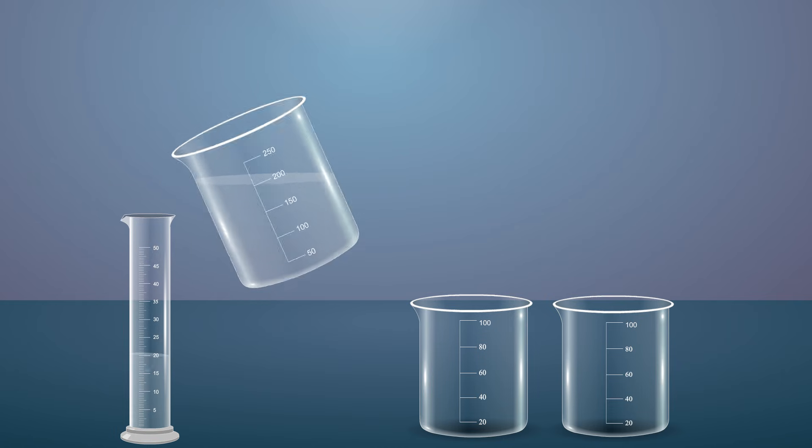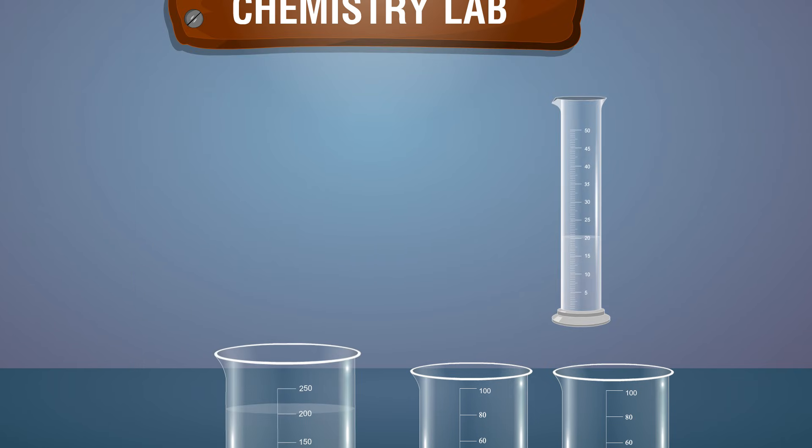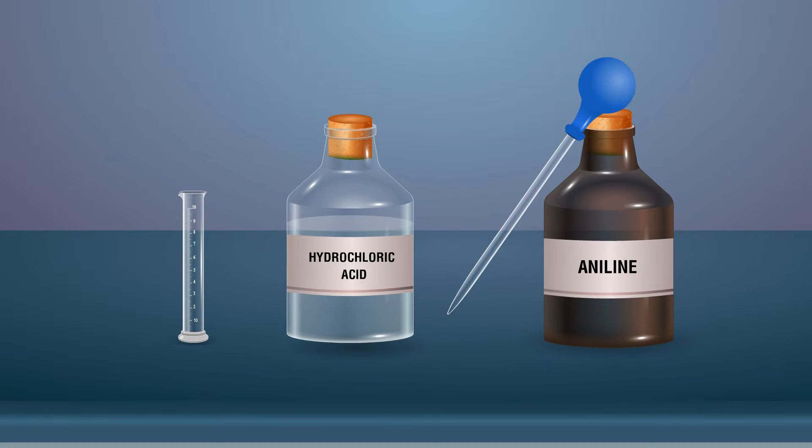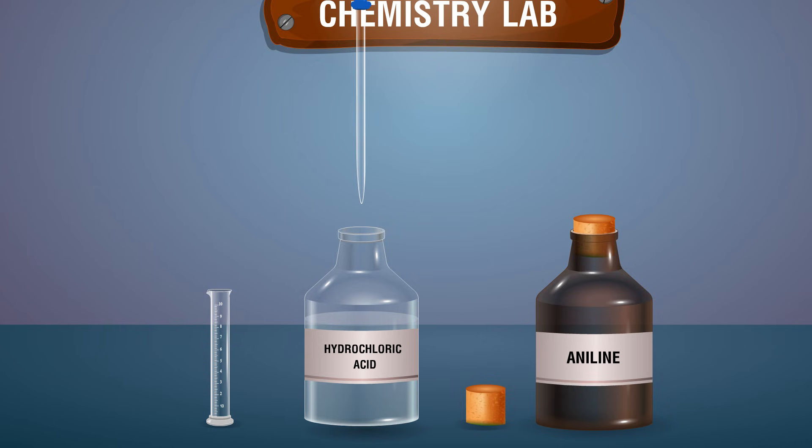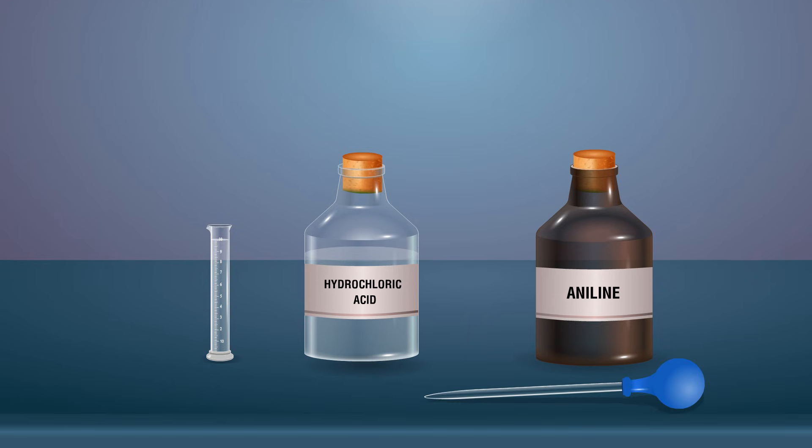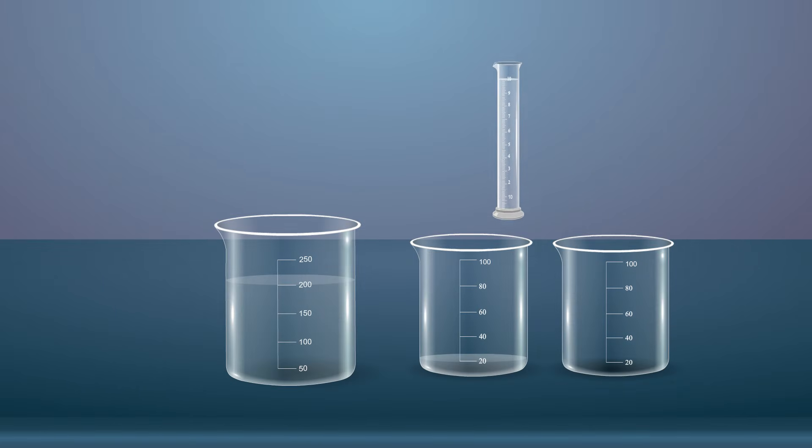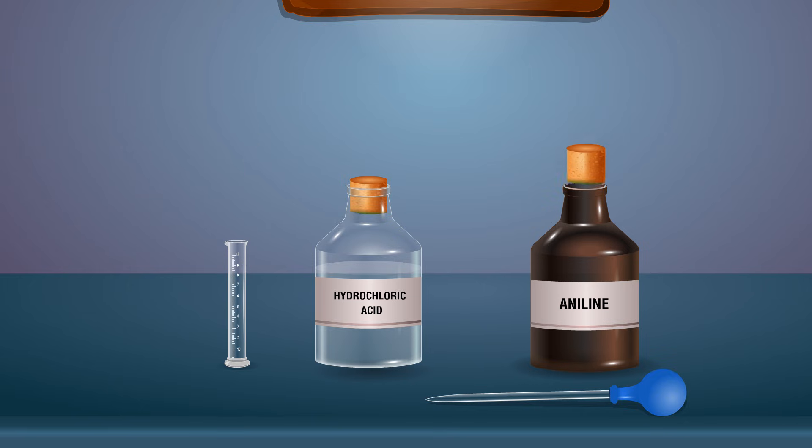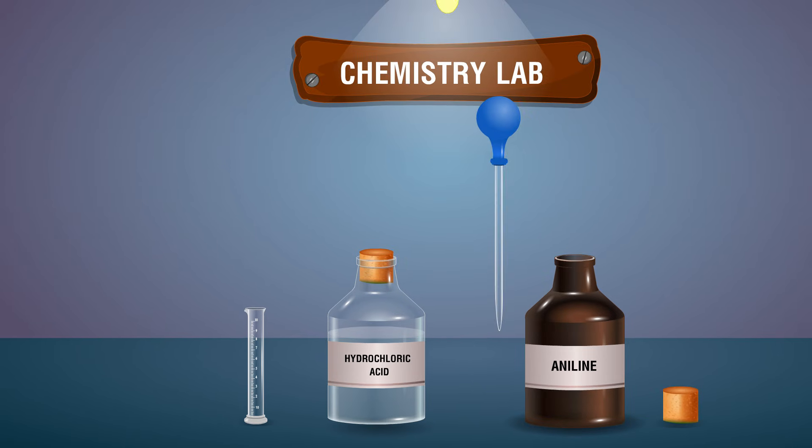Take 20 milliliters of water in a beaker using a measuring cylinder and take 10 milliliters of concentrated hydrochloric acid with the dropper and add it to the water. Add 4.5 milliliters of aniline using a dropper to a measuring cylinder and add it to the mixture.